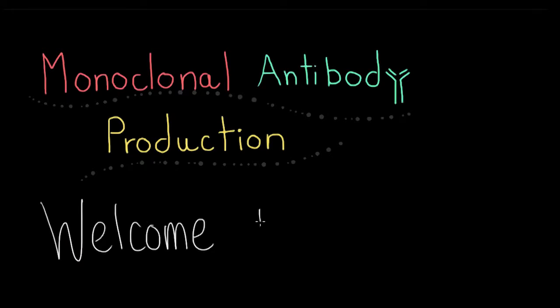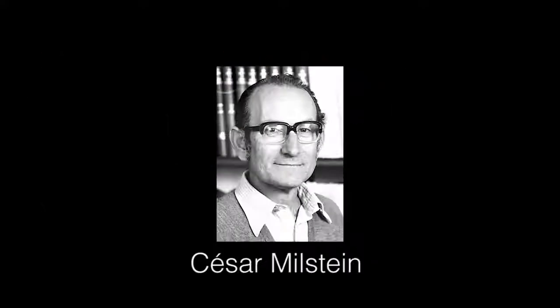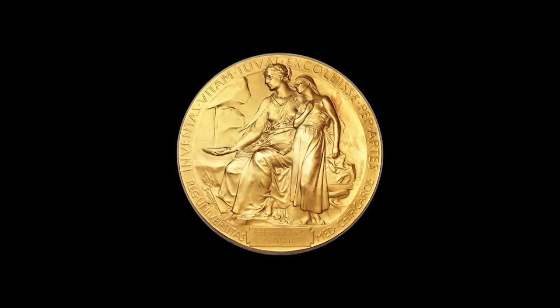Last time we learned about what monoclonal antibodies are and how they play an important role in medicine. In this video, I think we should take a look at how monoclonal antibodies are actually made. The original method was created by Cesar Milstein and Georges Köhler in 1975, and they actually won the Nobel Prize in Physiology and Medicine for their work.